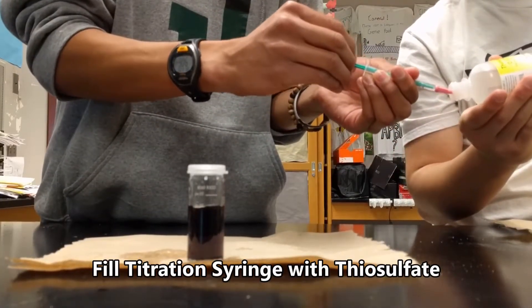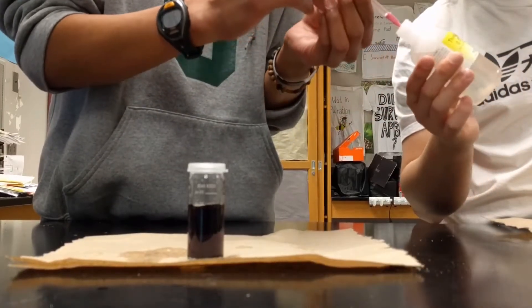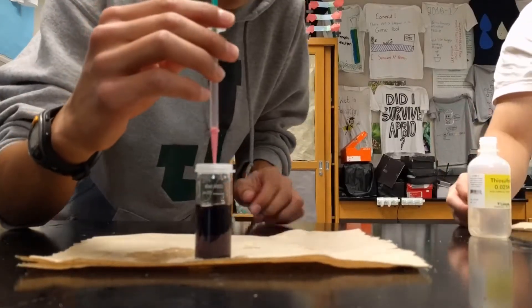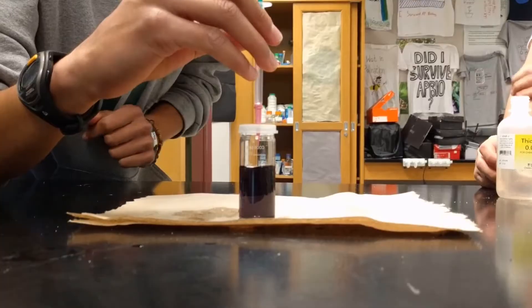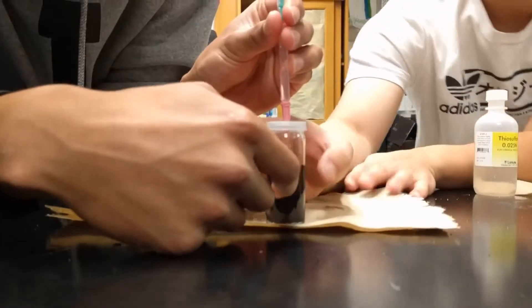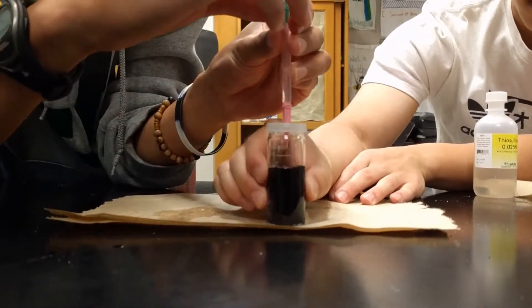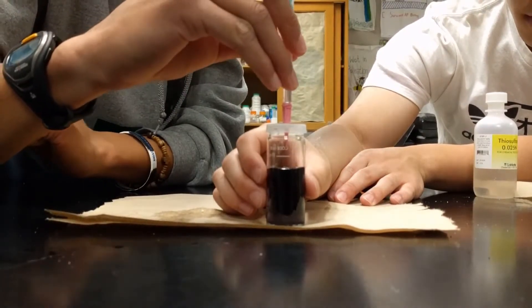We will cap our titration vial and fill up the titration pipette syringe with thiosulfate. We will titrate the sample by slowly adding drops and swirling at the same time. Once all the black disappears and we have a clear solution, then we will have the value to measure the dissolved oxygen.